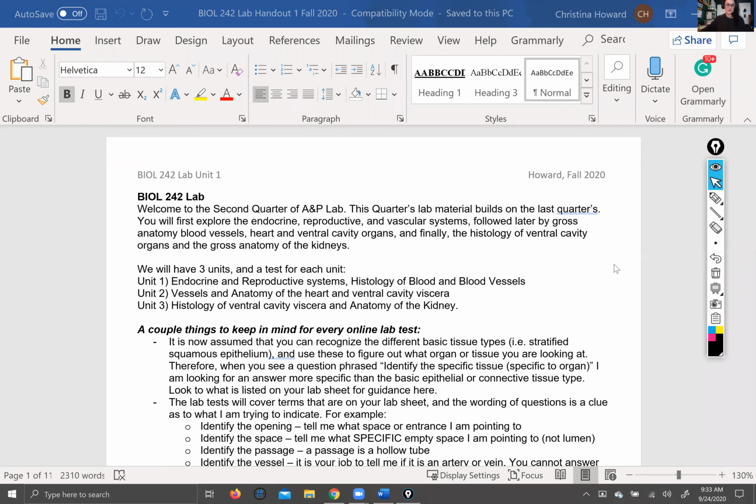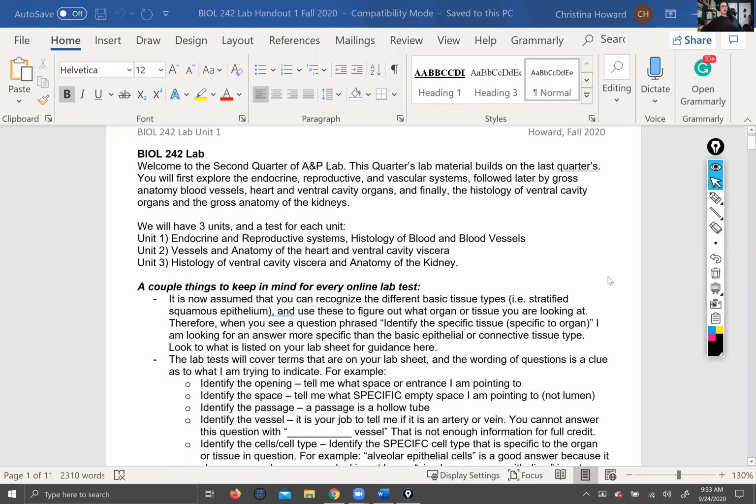The purpose of this video is to do two things. One is cover the histology of the uterus, because that wasn't present in previous terms, so I don't have a video for it. And the other one is to sort of model how to use the lab packets and how to look for what you need to look for, and just be a good independent learner for lab.